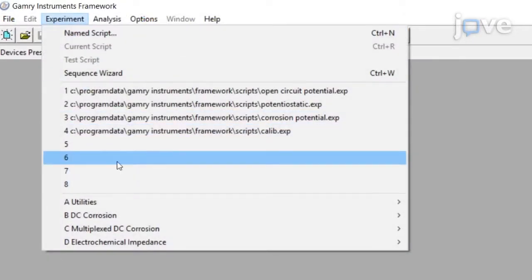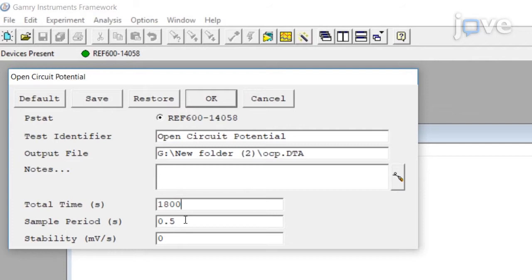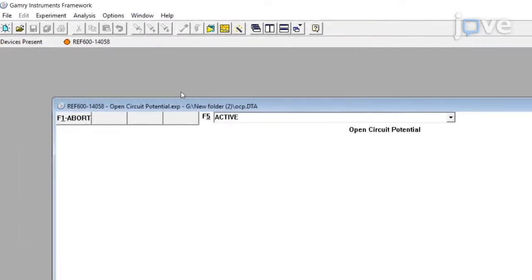To measure the tribo-corrosion rate from the tribo-corrosion test at the open circuit potential, repeat the test as demonstrated but with the applied potential set to the open circuit potential.